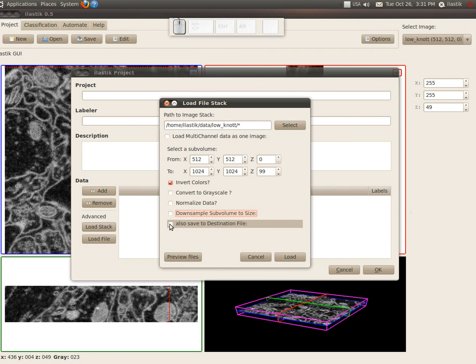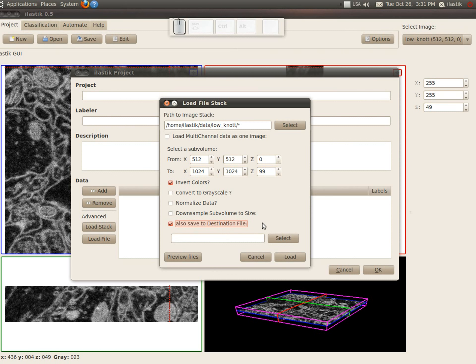The last option is also quite interesting. It allows you to save the whole stack into one file. Now the advantage of this is that first you have the whole thing in one file and second is that you can later on use it for automated processing in batch mode.